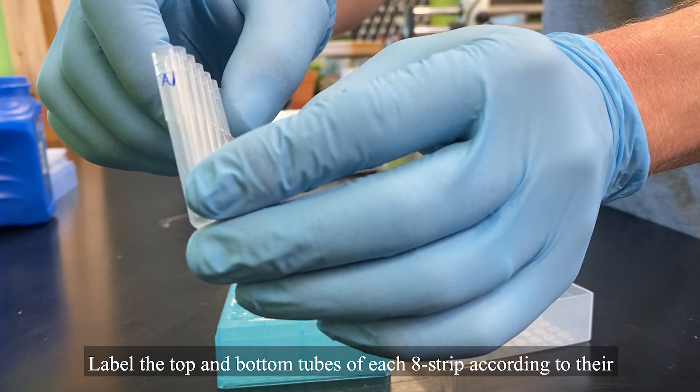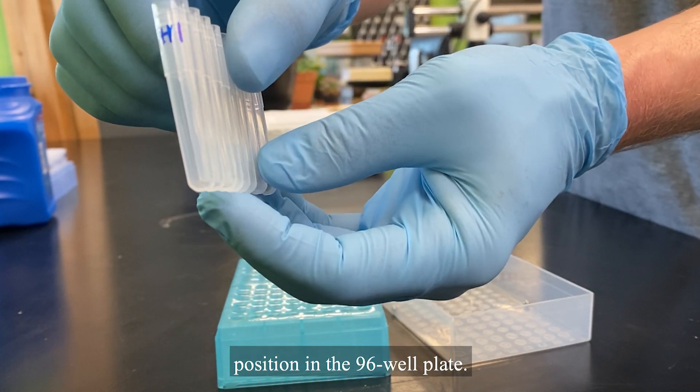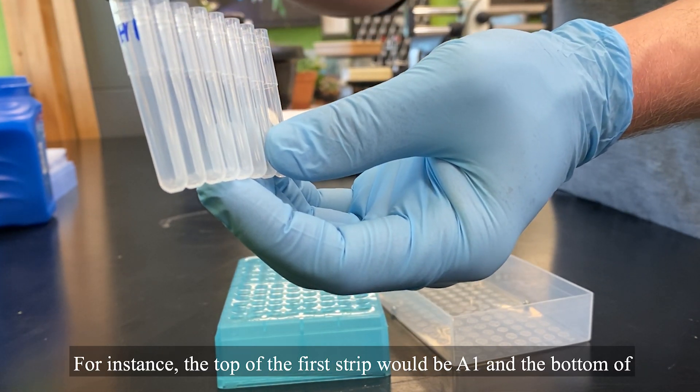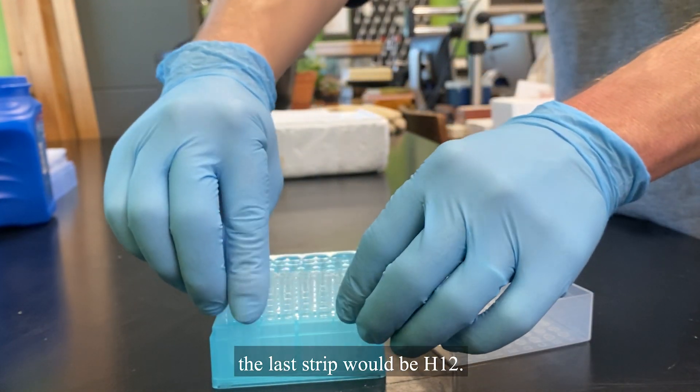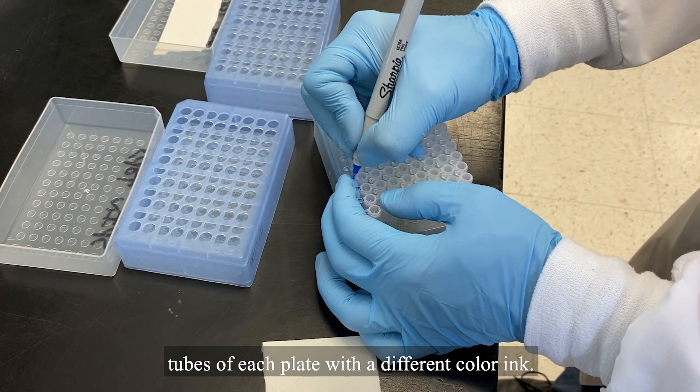Label the top and bottom tubes of each eight strip according to their position in the 96-well plate. For instance, the top of the first strip would be A1, and the bottom of the last strip would be H12. Note that if you're doing two plates, it's helpful to number the tubes of each plate with a different color ink.